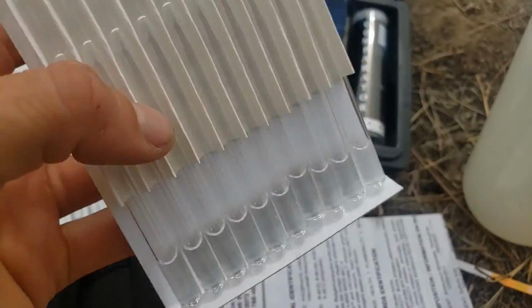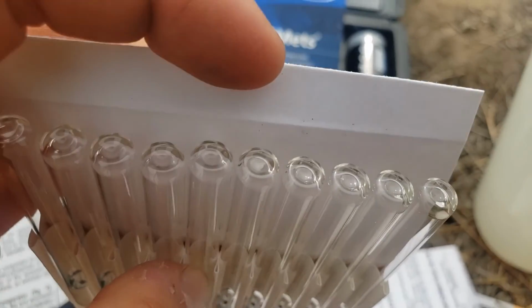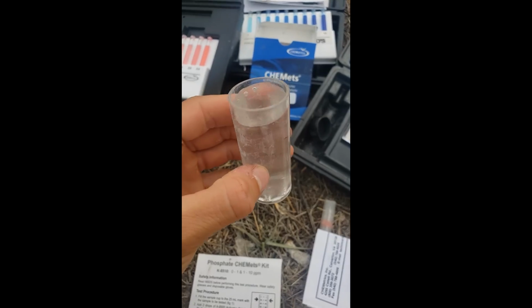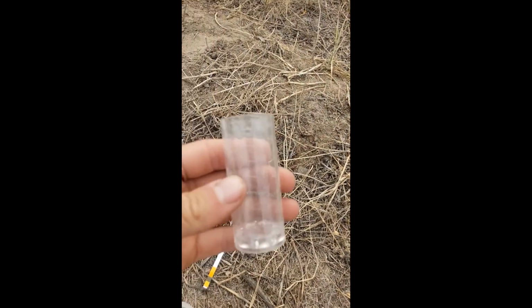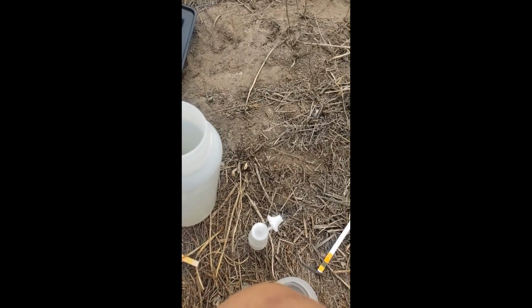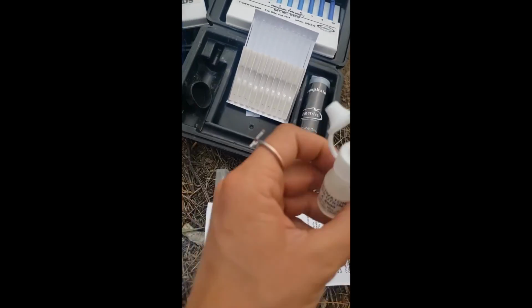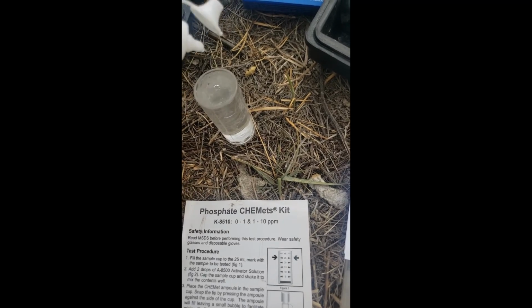Actually, let me take a minute. I've never done this before, so let me figure out what's going on. Step one, fill this up. And I'm actually just going to wash it out from before, so I'm going to fill it with the water and then wash it out one more time. You'll see this go down. I'm going to add my indicator activator solution, 2 drops. 1, 2.